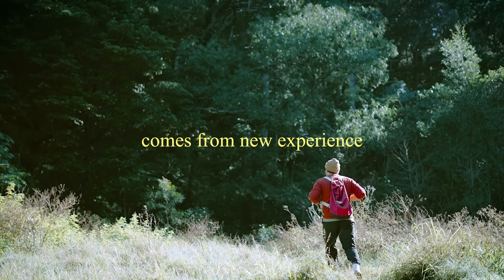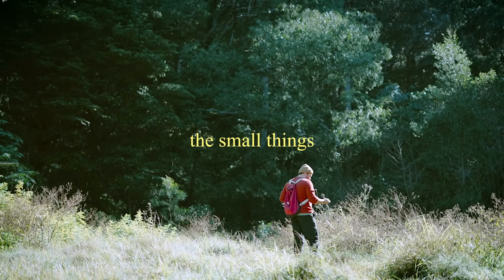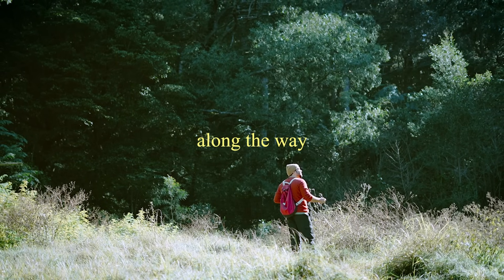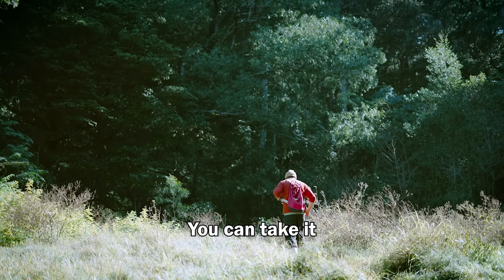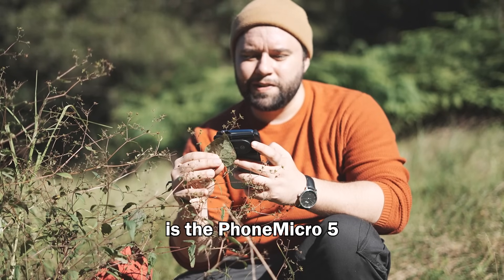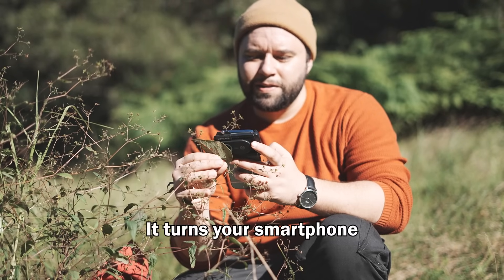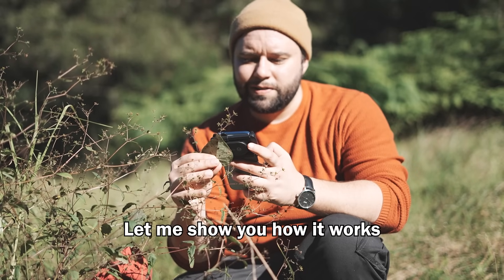The core of life comes from new experience, but peace is when you stop to appreciate the small things along the way. I have a very cool microscope to show you — you can take it anywhere with you. This is the Phone Micro 5 brought to you by Apexel. It turns your smartphone into a powerful microscope. Let me show you how it works.